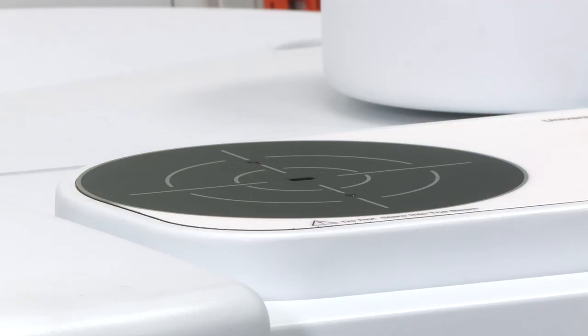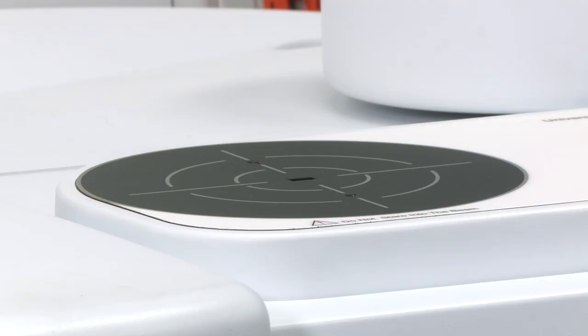Typically this is used for specular samples, shown in this example here, a standard mirror which is very well polished here. We will simply place a sample on the top part of the URA and then place a cover on top of it. Now, in this configuration, the software is capable of measuring specular reflectance that is coming off the sample.